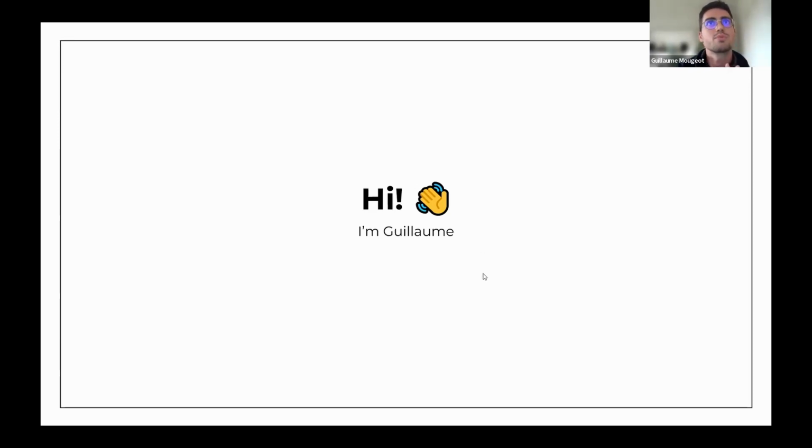Just before presenting anything, I would like to take a small survey. It will be a bit interactive today, so if you would like to try the tool that I'll present, feel free to follow along with my presentation.